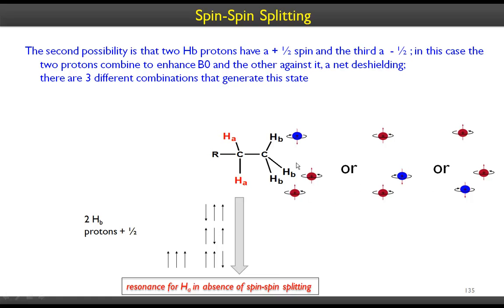Remember that all these molecules are of the same compound, just different molecules. And this is the average data collection, right? This is the FID that collects all the data points, remember.